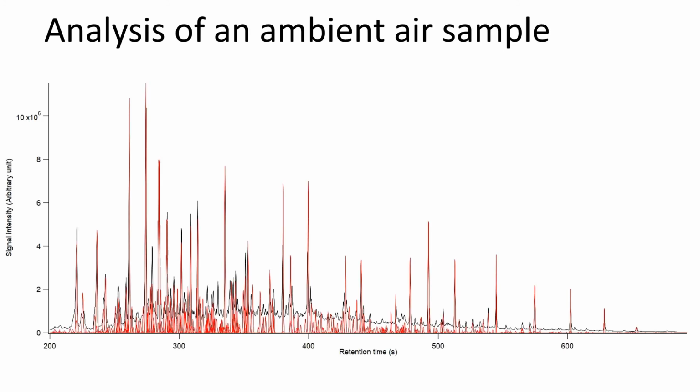After validating the accuracy of the software using control samples, analysis of a real-world ambient air sample was performed. Samples were collected near an urban area surrounded by a forest located in the central Amazon. 4 chromatograms are used, and a total of 606 analytes were found within a 1-hour period of analysis.